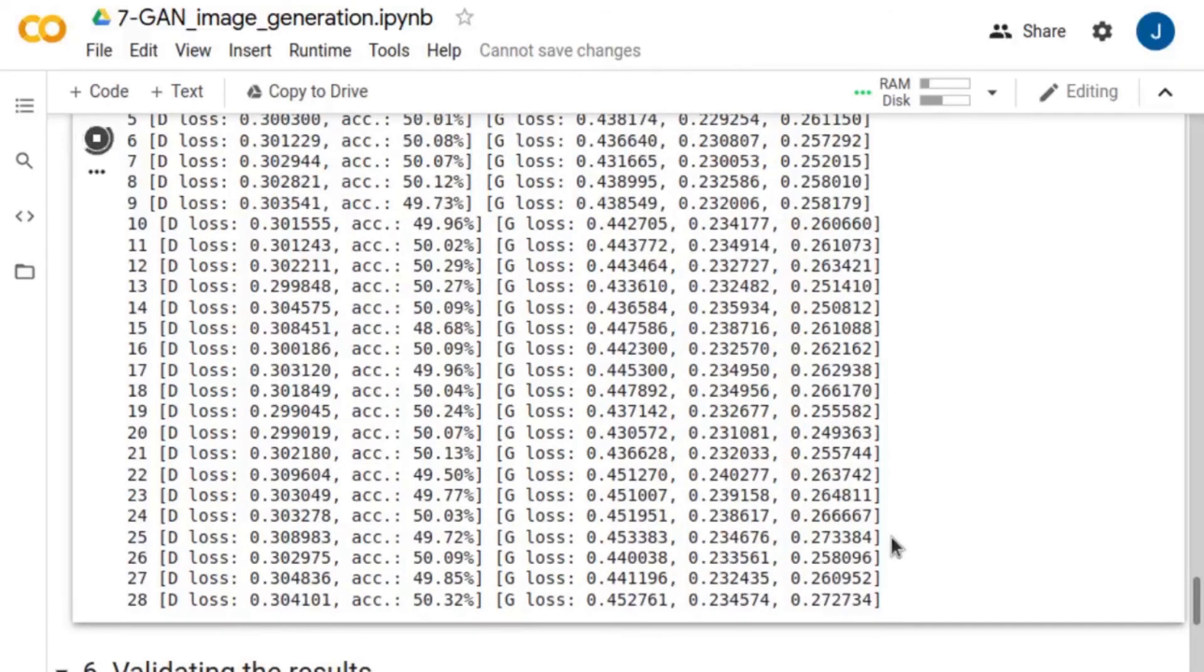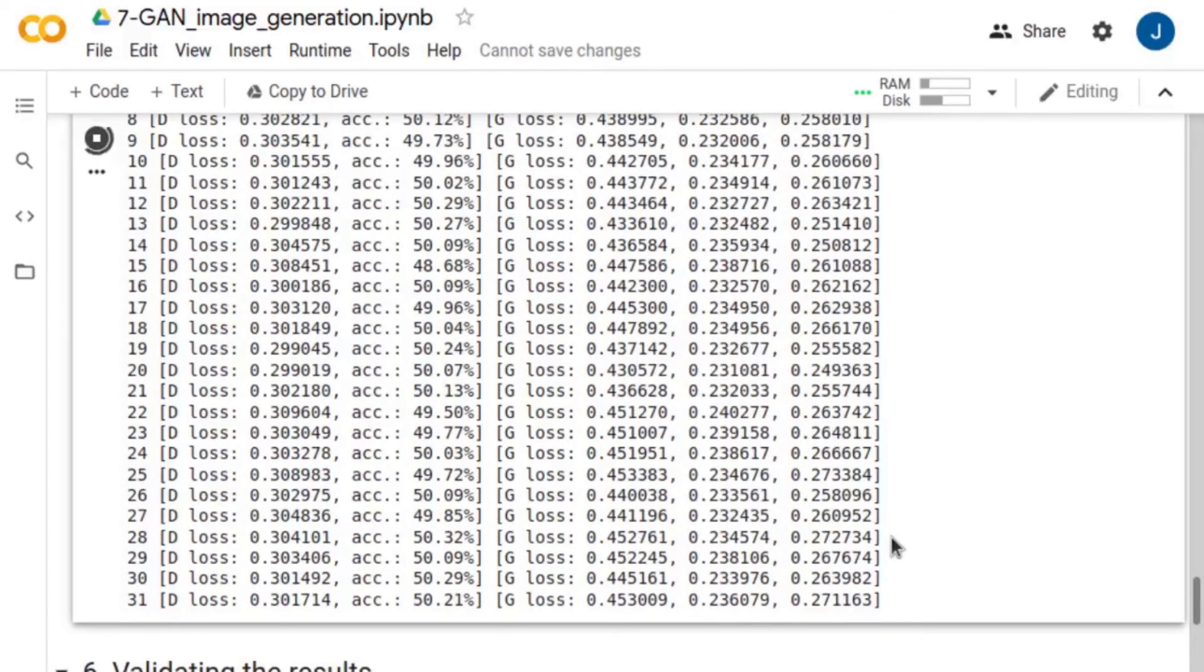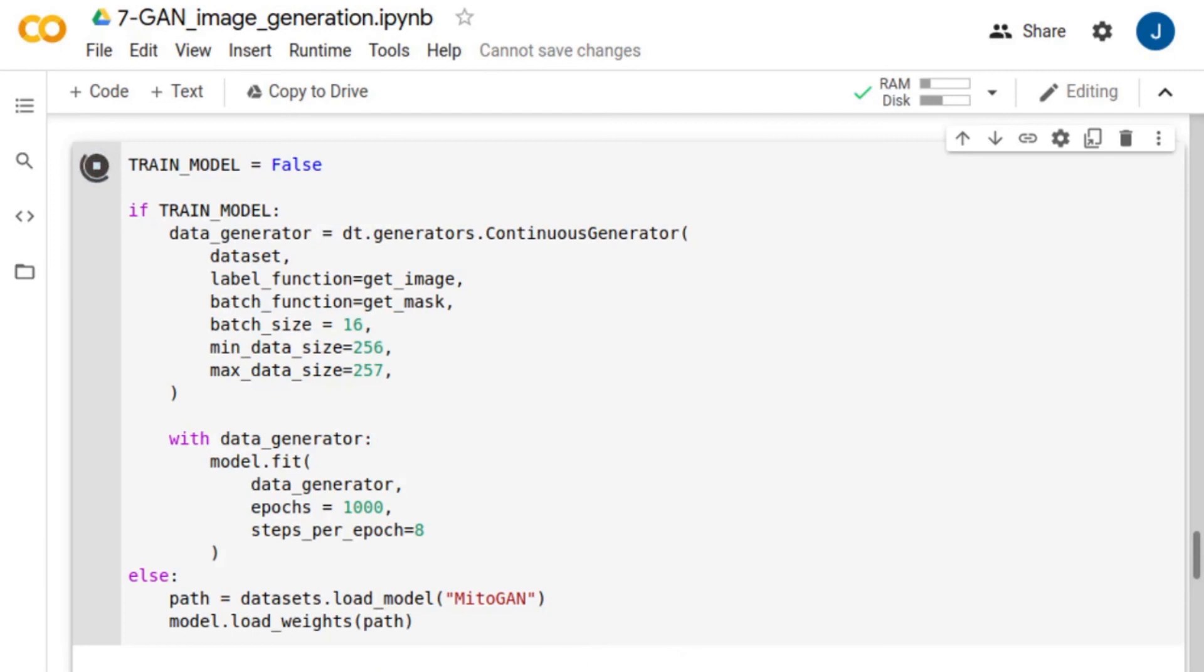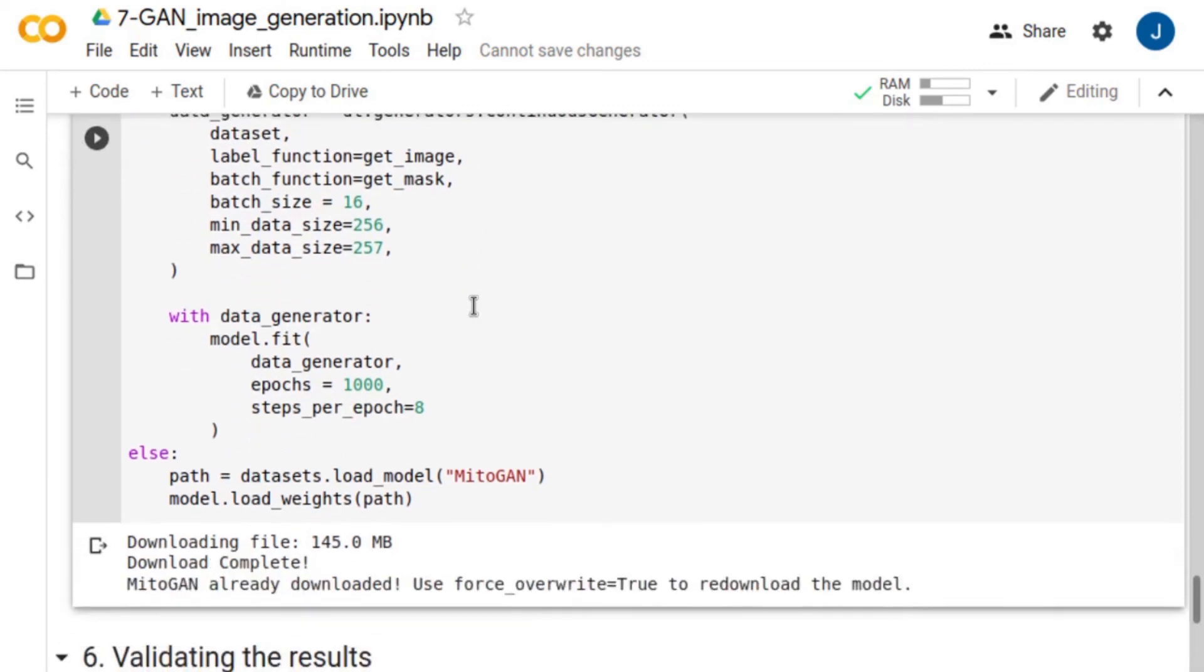Training this network would take hours. Hence, now we will download pre-trained weights for visualizing the results.